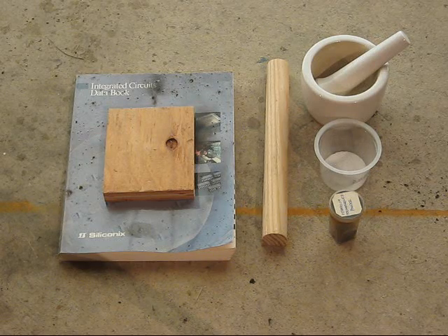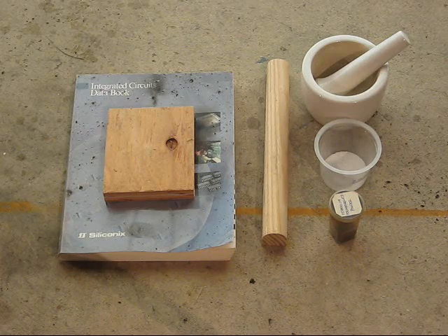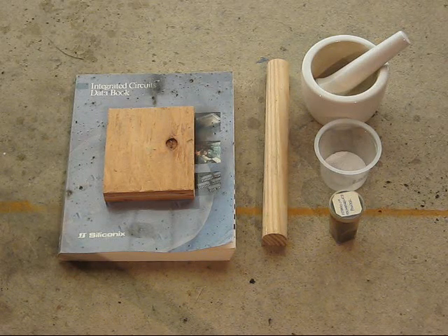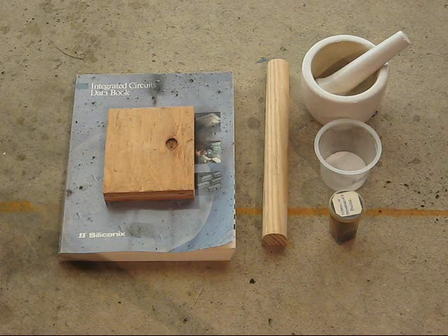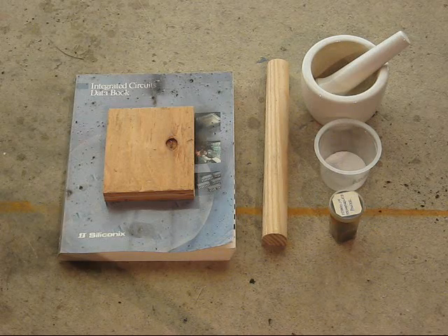There are several cautions with this. Don't do any of this without some sort of protective gear — at the very least, goggles. Gloves would be a good idea, too.